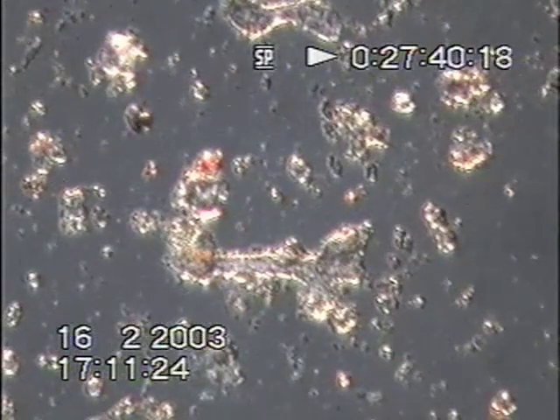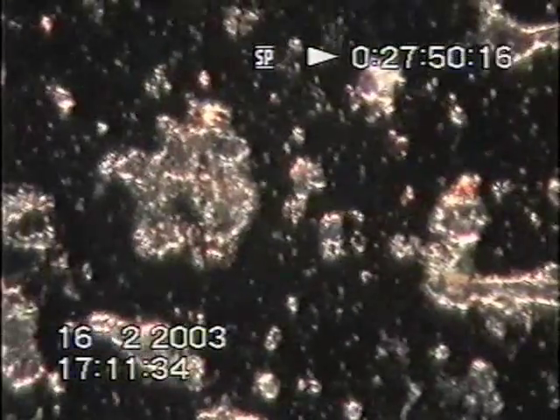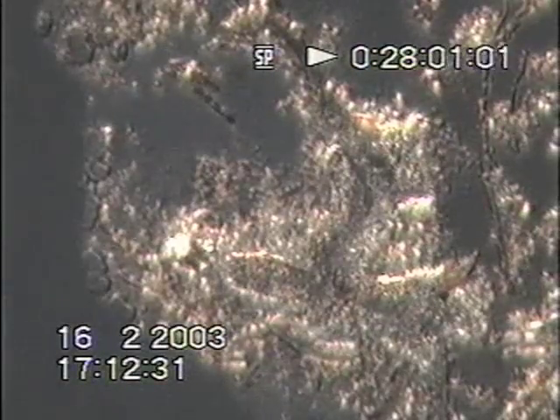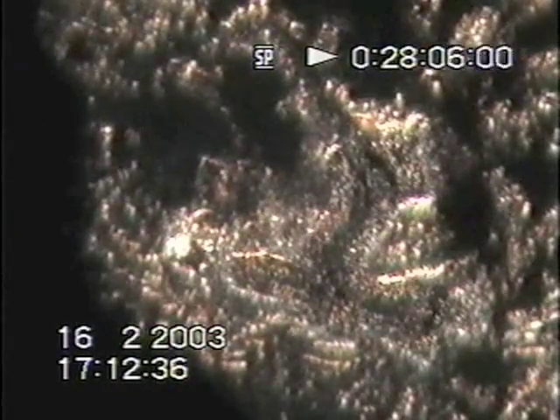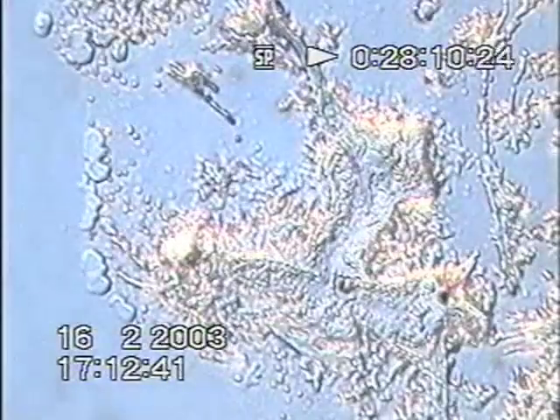Slide 15th of February, we can see crystals, but they are surrounded by tiny particles. As we cut the light down, we can see this quite dramatically. The tiny particles are coating the crystals, which are all shapes and sizes. Here we're getting to the edge, and as we cut the light down, this effect is becoming more obvious. And we turn it up and we can see the shape, more or less, of a crystal.